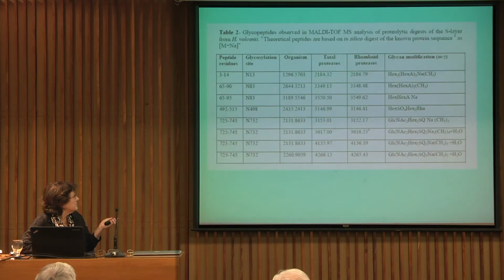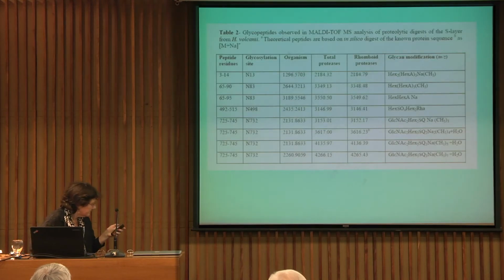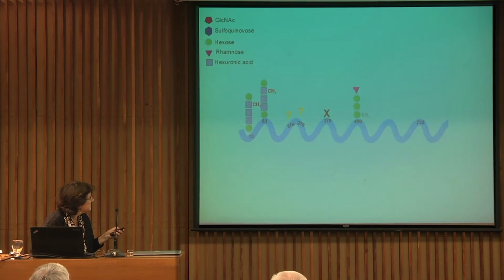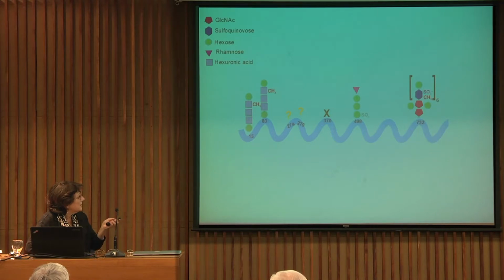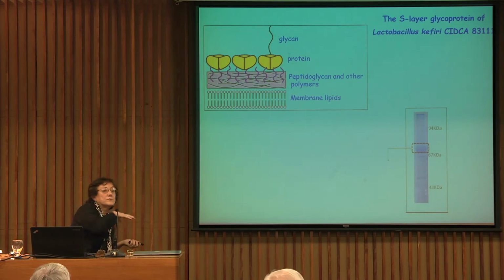So up to this point, we could say that to the known glycosylation sites, we could add another glycosylation site, N732, bearing this new oligosaccharide. Well, all this work was performed with MALDI.